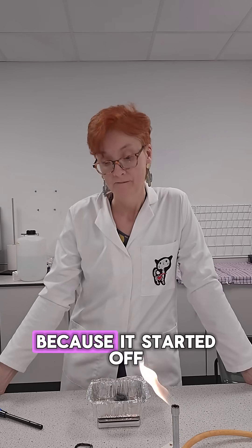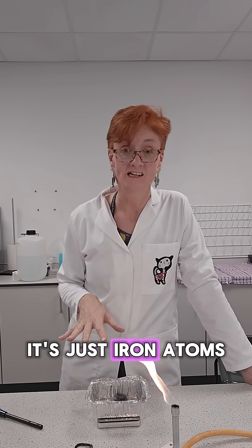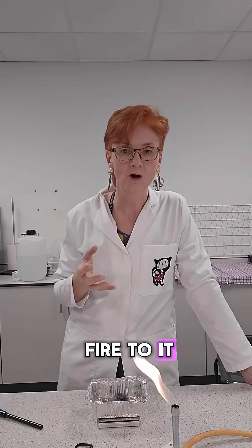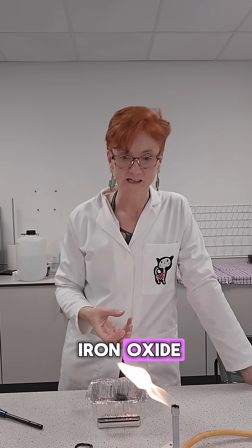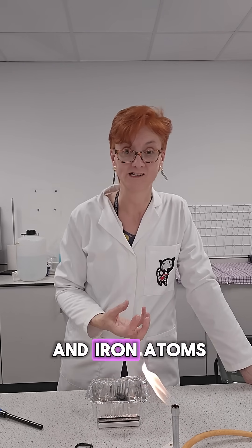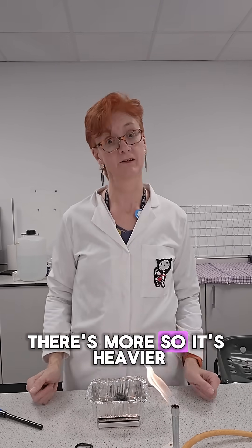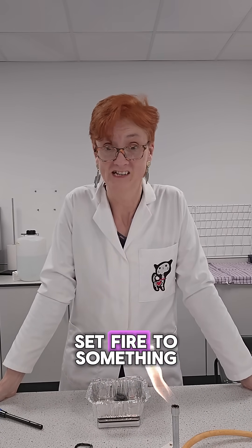It weighs more because it started off as iron — just iron atoms. And then we set fire to it, and what happened was the iron combined with the oxygen to make iron oxide. And so now it's got oxygen atoms and iron atoms — there's more, so it's heavier. Works. And you know what? I knew it would work. I just wanted to set fire to something.